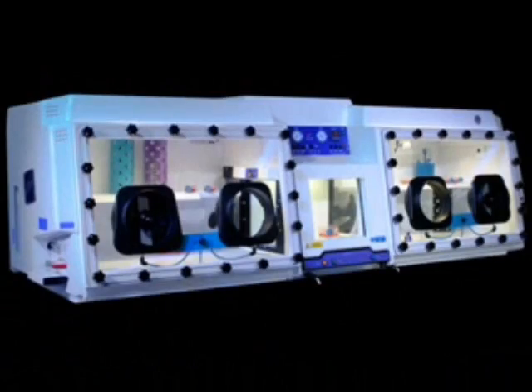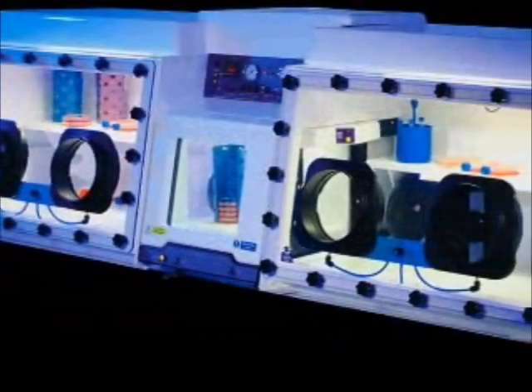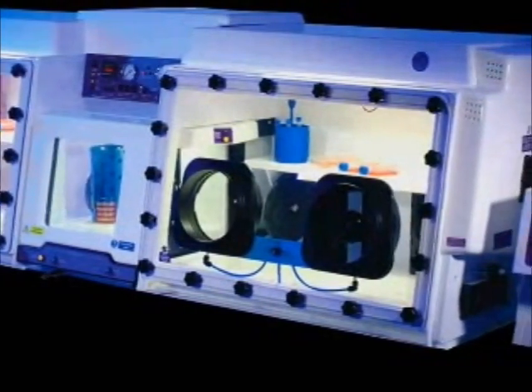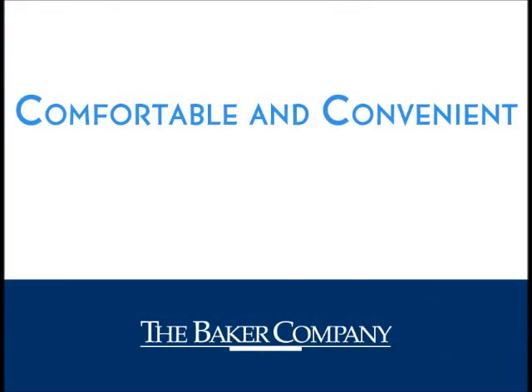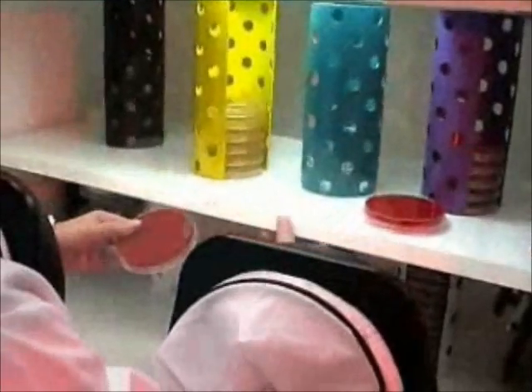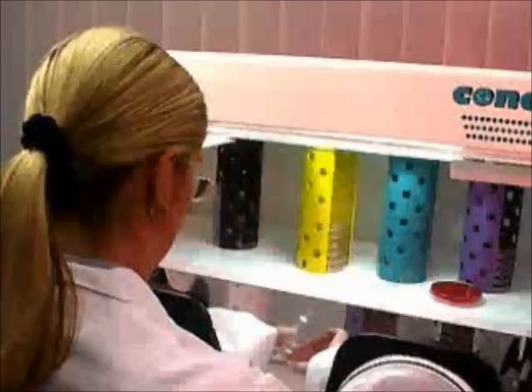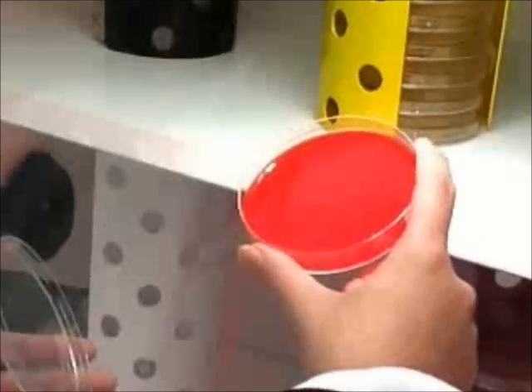Designed for larger laboratories, the Ruskin Concept 1000 Anaerobic Workstation offers a 1000-plate capacity and features two independently controlled environments, each accessible through a large central interlock. The workstation can be configured with an optional gas mixing module to create a microaerophilic atmosphere within one of the chambers. All Ruskin Workstations feature both a convenient pull-out shelf for easy access to stored samples, and a foot-operated halogen spotlamp for assistance with sample identification.